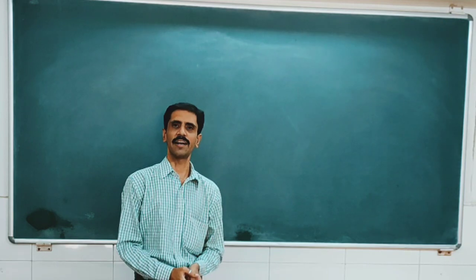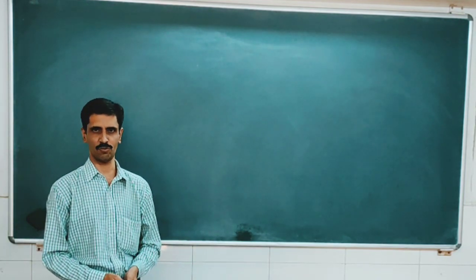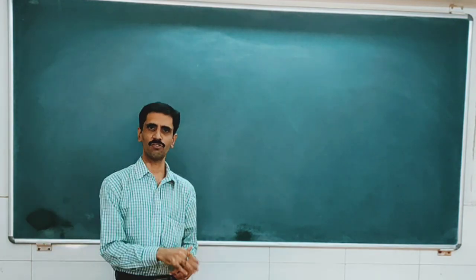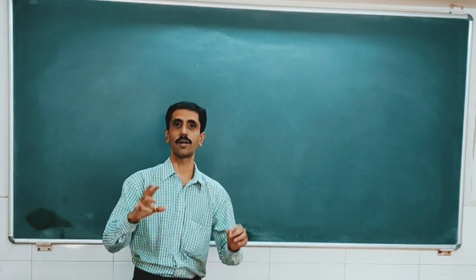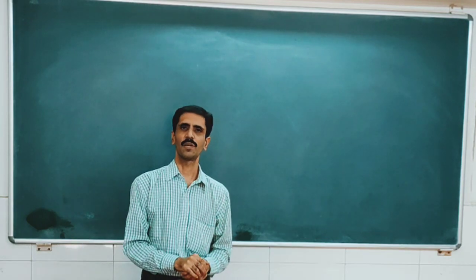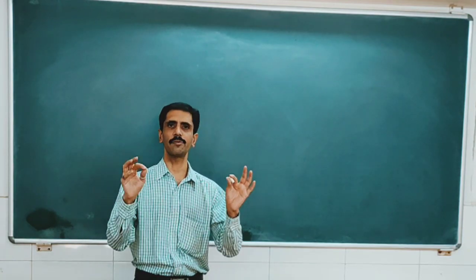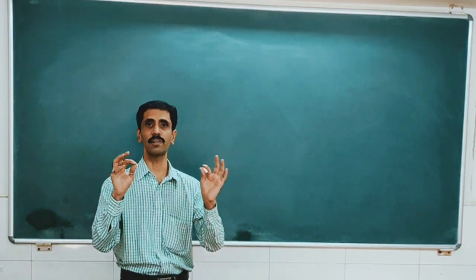Now this is another video which is based on practicals of inorganic chemistry. In the previous two videos, I have explained you about the inorganic preparations. Alright? Now in today's case, we are going to discuss about the qualitative and quantitative analysis of mixture.